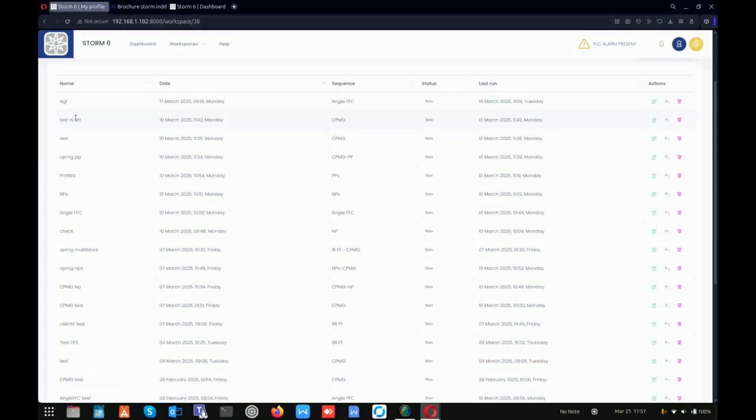What we suggest normally is to give the experiment a name based on the sample which you are using and the date on which you have created it, just so that in the future, if you open the same experiment after some time, from this name you will easily identify why you created and performed this experiment. It gives you some information which can be helpful in future.